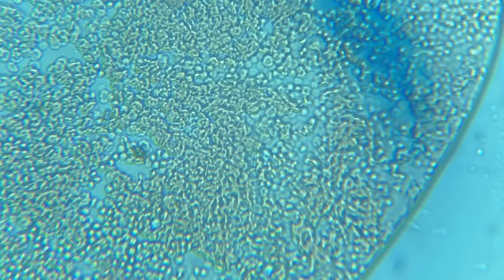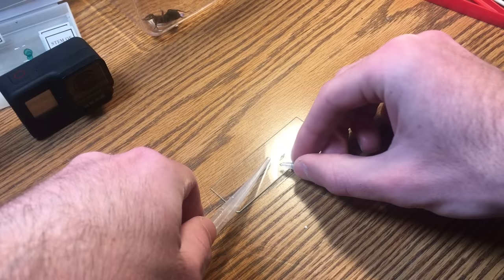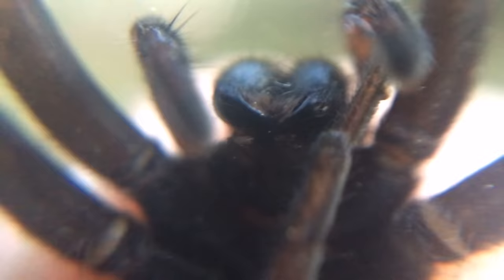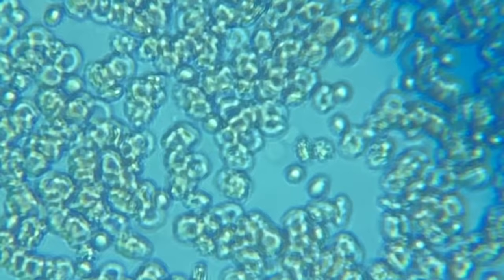But I find it absolutely fascinating that I'm seeing this kind of behavior of the blood cells under the microscope compared to the healthy sample after I've added some scrapings of wolf spider venom. Now, keep in mind, this is concentrated wolf spider venom in a very small sample of blood. If a wolf spider bites you, these effects are not going to be as severe unless you are allergic to the venom or something. Wolf spiders only use their bite as a form of last resort defense.